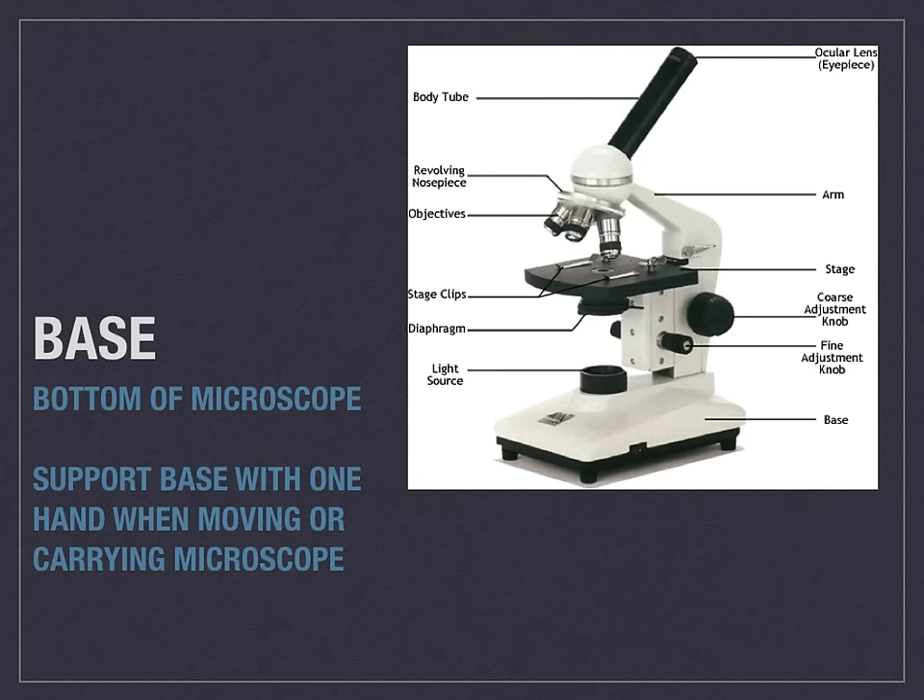The base is something that I've mentioned before when I was referring to the arm. It is located at the very bottom. It is what you would also support with one hand when you are moving or carrying the microscope. Usually the base will contain the light source.